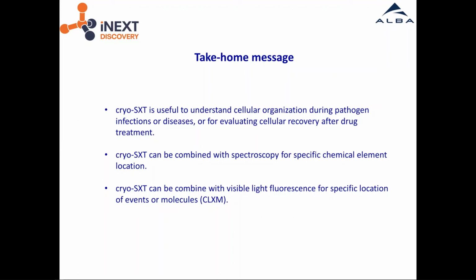It is always combined with, in general, visible light fluorescence, but can also be combined with hard X-ray fluorescence. I haven't shown this here today, but this is feasible.